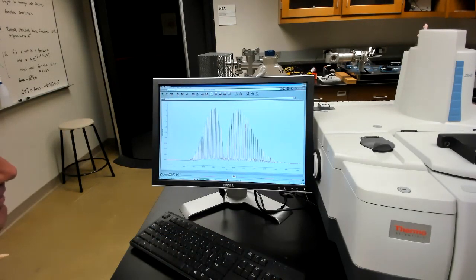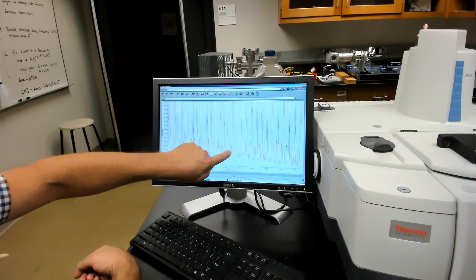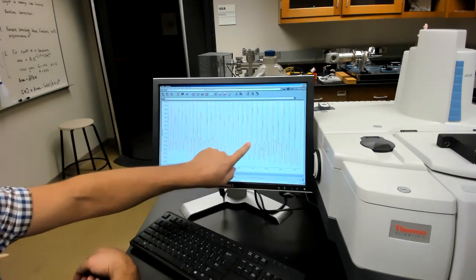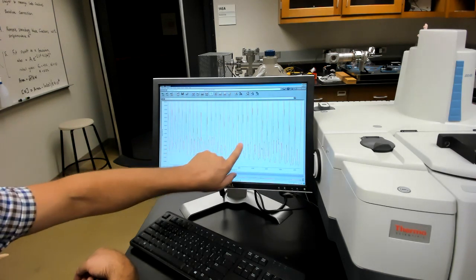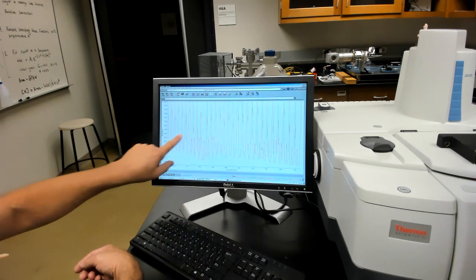Okay, before we leave the carbon dioxide, I want to focus on something interesting here. It's a little hard to see in what you're looking at in the video recording, I'm sure. But maybe if we blow it up a little bit, it'll be easier. Maybe not. Let me also zoom in a little bit this way. It's hard to see, but perhaps you can see here that in addition to the very strong lines we were looking at before, there's another series of weak lines here. They're much weaker, but otherwise they look similar, and they seem to be associated with carbon dioxide as well.